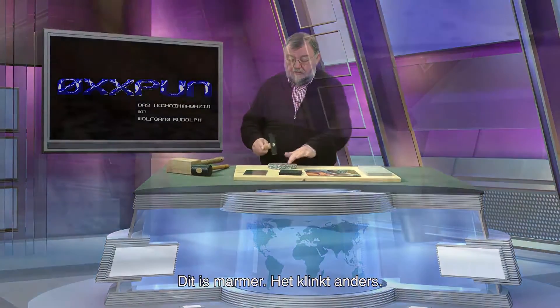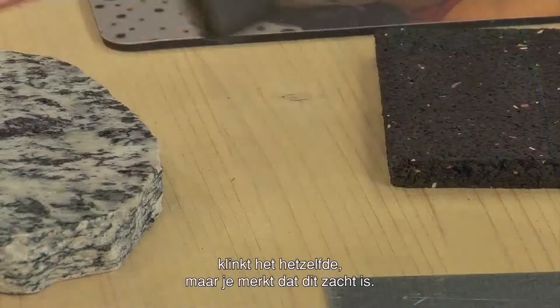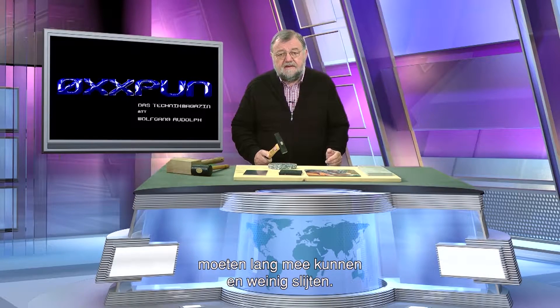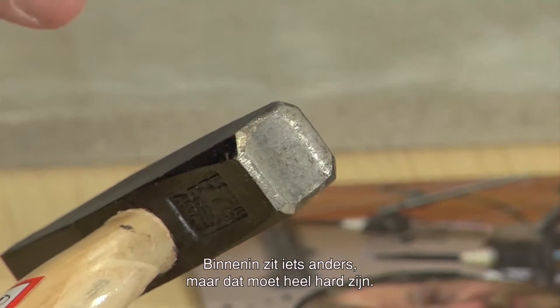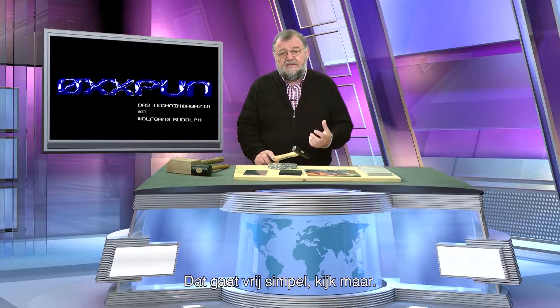That is aluminum. Here is marble. It sounds differently. When I hit wood, it sounds alike, but you notice it is soft. That is not enough for us. For example, a coke wheel and a gearbox, when asked to live long and have little wear, then I need a very big surface hardness. Inside is something different, but that must be very hard. But how can I determine how hard a material is?